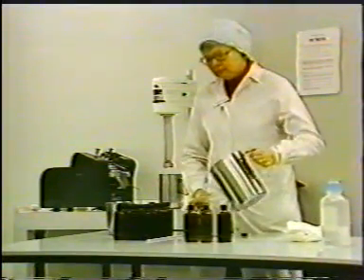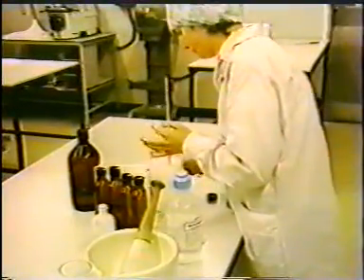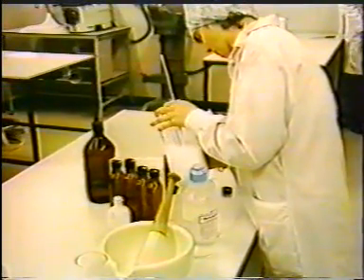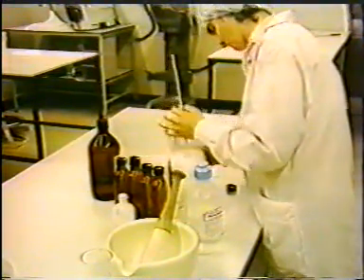It is a legal requirement of the Medicines Act 1968 that such a system of quality control should exist, and much detailed guidance on manufacturing and quality control is given in the Guide to Good Pharmaceutical Manufacturing Practice, commonly known as the Orange Guide.